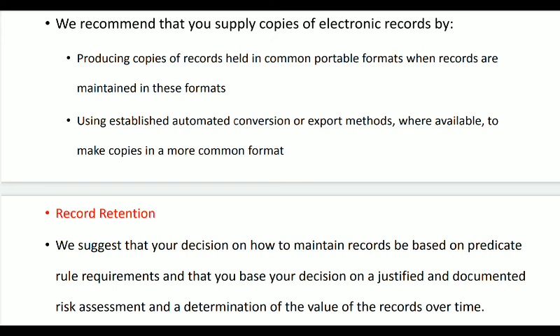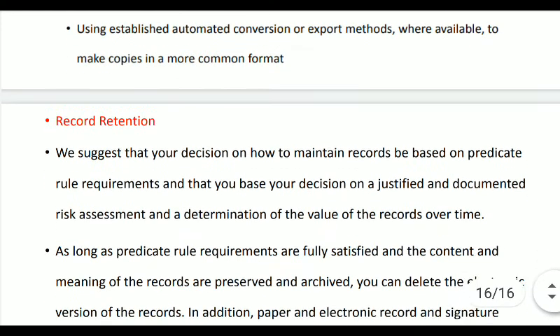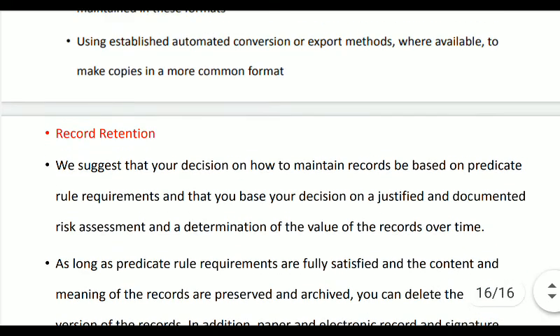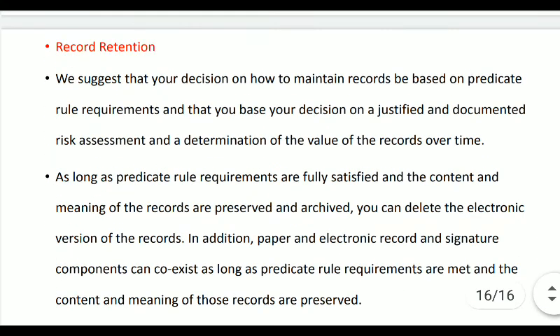Mainly you can give them tablets or you can provide them soft copy of documents using established automated conversion or export methods, where available, to make copies in a more common format. So you can use some internet based application in order to share your information with the inspector. Next is about record retention.